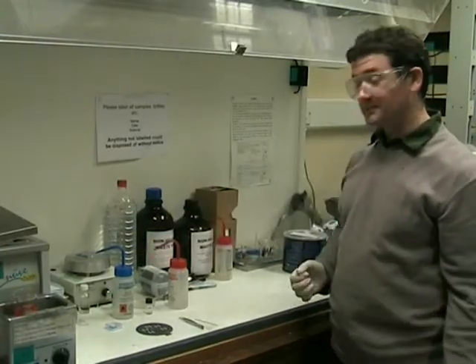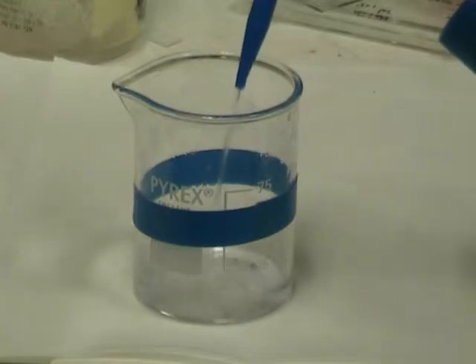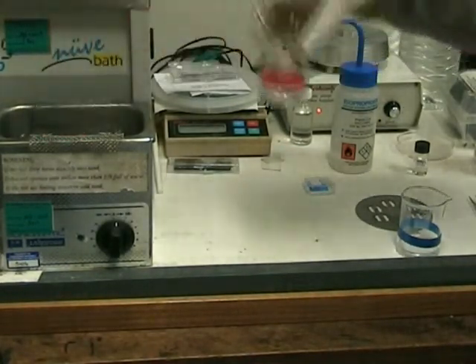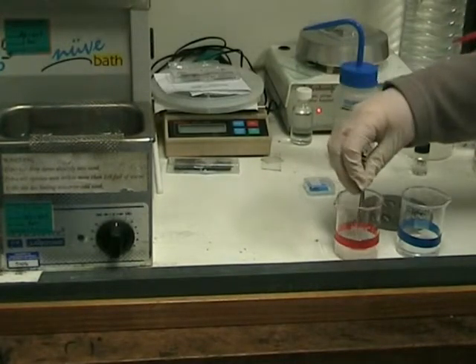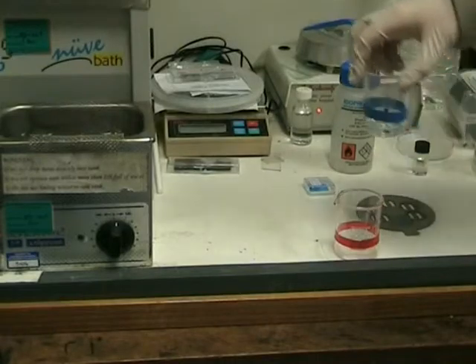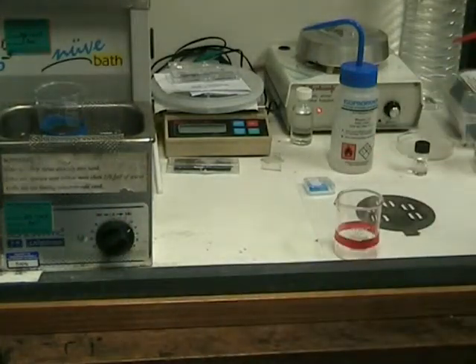IPA stands for Isopropanol Alcohol. The IPA is stored in the blue bottles, and we use the beakers with the blue colouring around them. Fill the beaker with a small amount of IPA. When the ultrasonic bath has finished, transfer the sample from the acetone to the IPA, then put the sample in the IPA into the ultrasonic bath again, again to around the 2 minute mark.